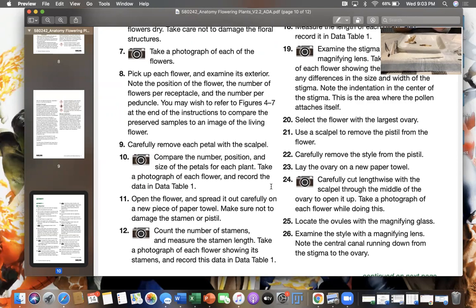Unpin, what I would recommend is use a single glove. Get that bag open. Throw all of your sample into said bag.